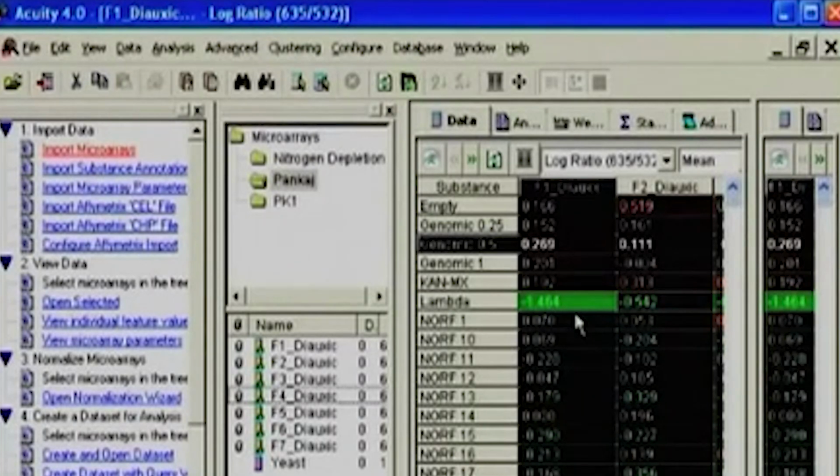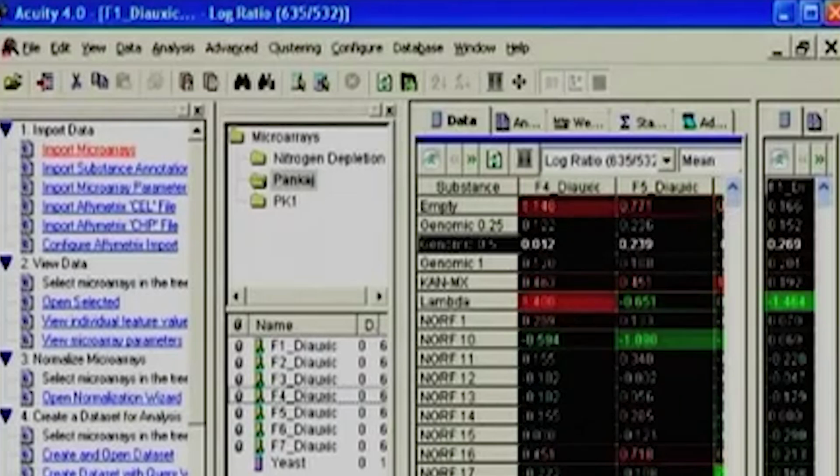The idea with this is which laser is being used for what. So in context, we have shown which kind of ratio you are using to check. Usually it is case over control that people report. So in this fashion, conventionally you can see the colors, but here there are many, there are many which we have opened now, six.